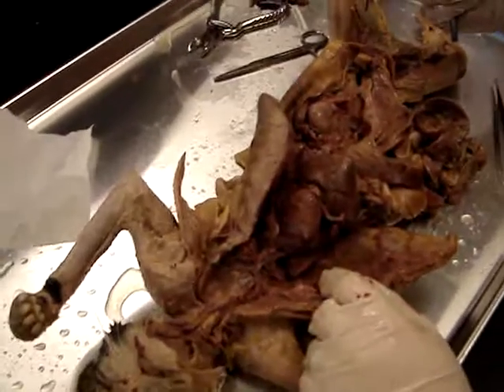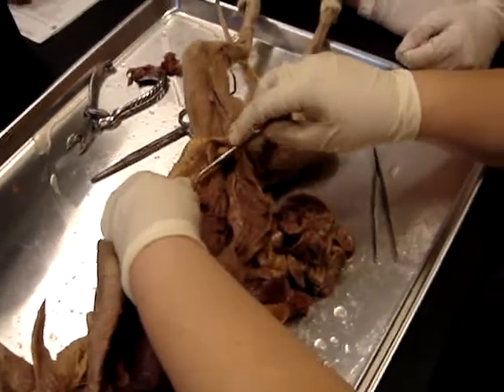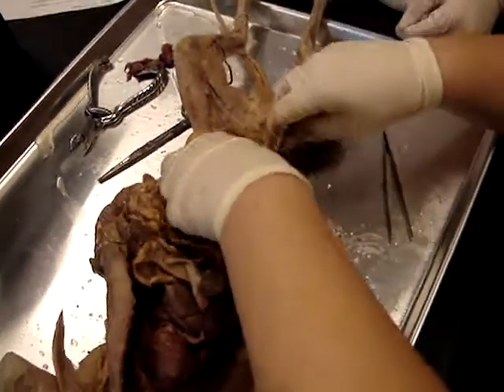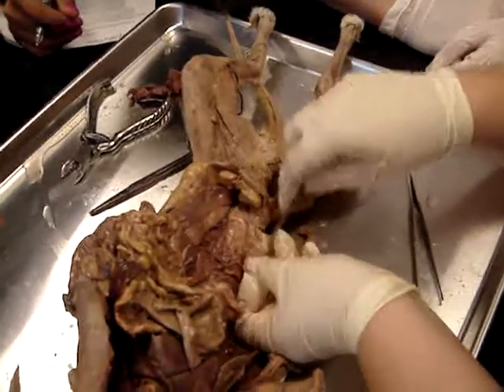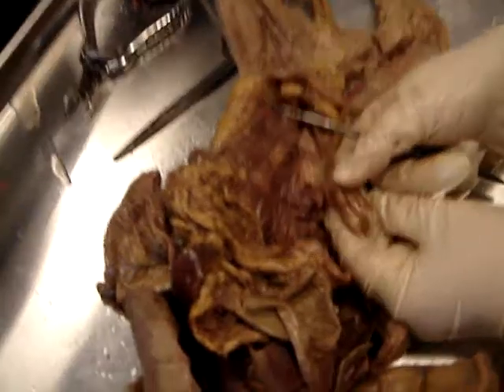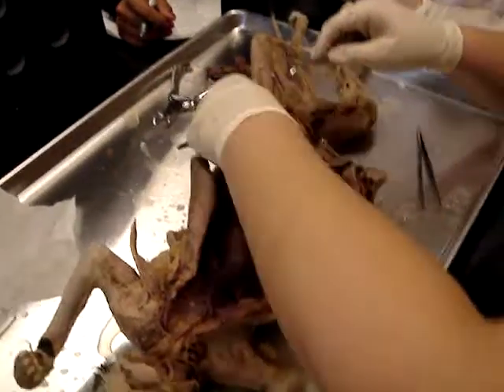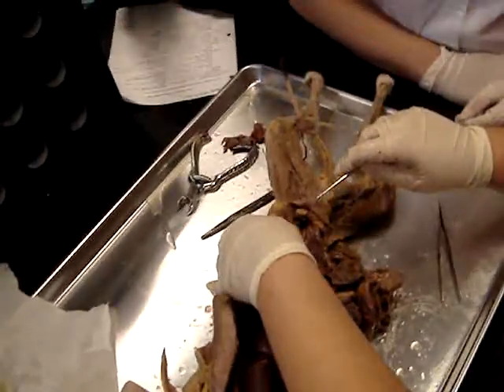The uterus, the oviducts, the ovaries, and the vagina. Okay? And so her ovaries look like little tiny beans, kind of. So this is one ovary. And then on the other side is her other ovary. Okay, so it looks like a little bean. See how each ovary is surrounded by a flap of tissue? That flap of tissue, here it is on this side, is the oviduct.